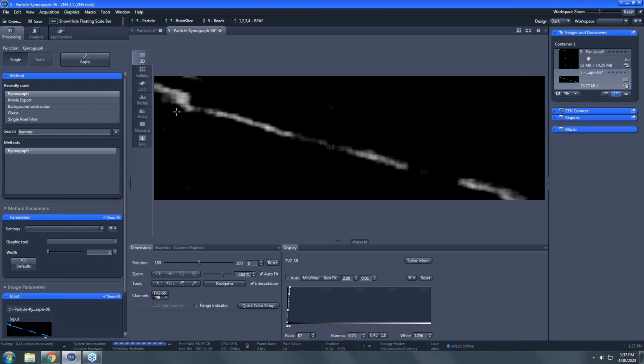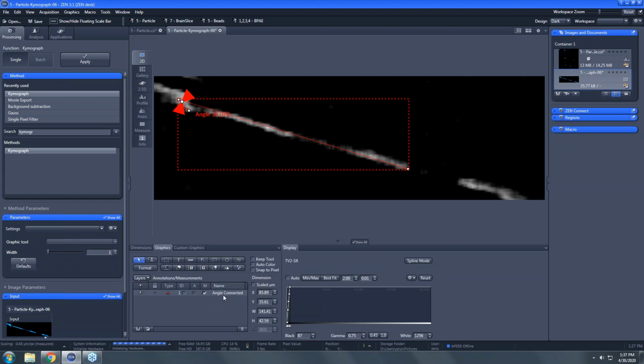Terrific. So we used the profile tool to measure the width of a bead. Then we used it to determine the velocity of a particle, and now we're measuring angles. So we wanted that one to run along the y-axis to measure the angle, so straight up and down. Anyways, I think they get what I mean here. I just wanted to mess around with that.